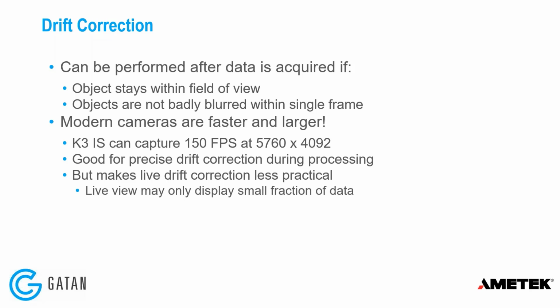And even if it could, that's not useful, certainly to the human operator who can't see data that quickly. And even to an algorithm, I think currently a PC would find it very challenging to process 150 frames per second at this high resolution.